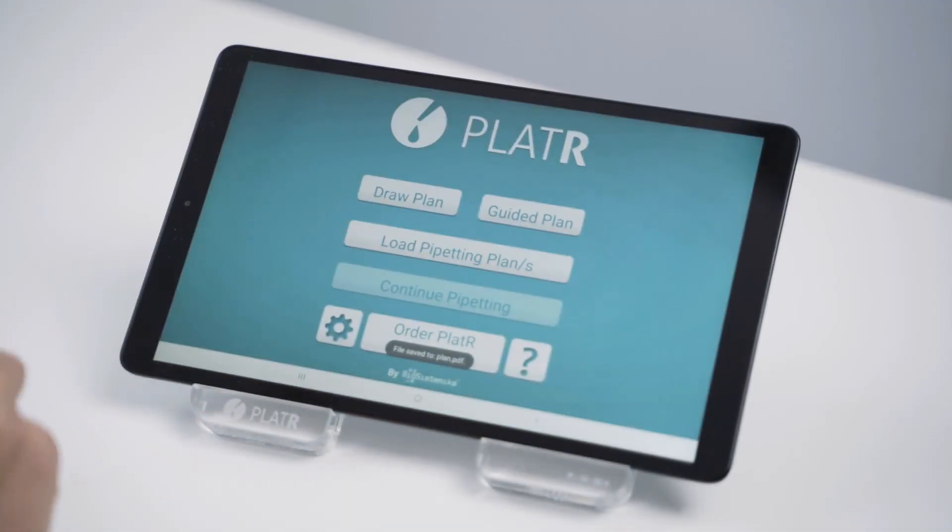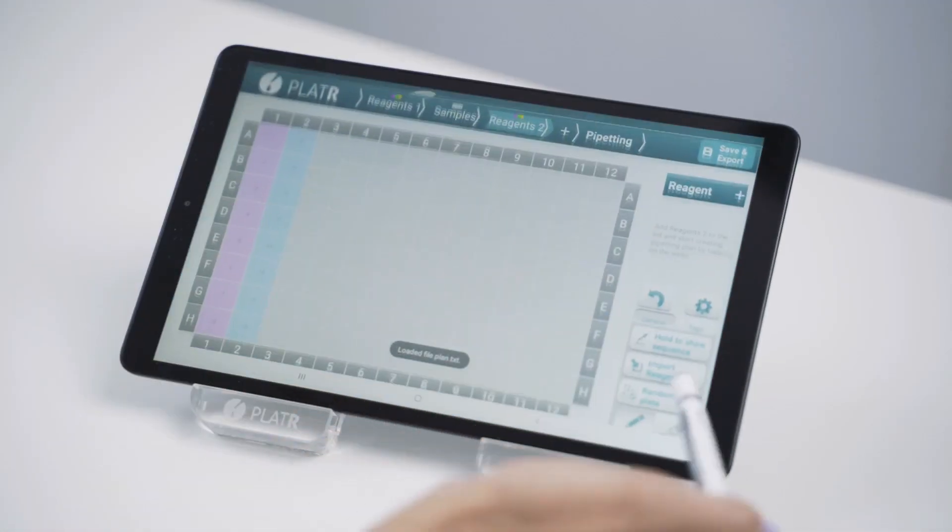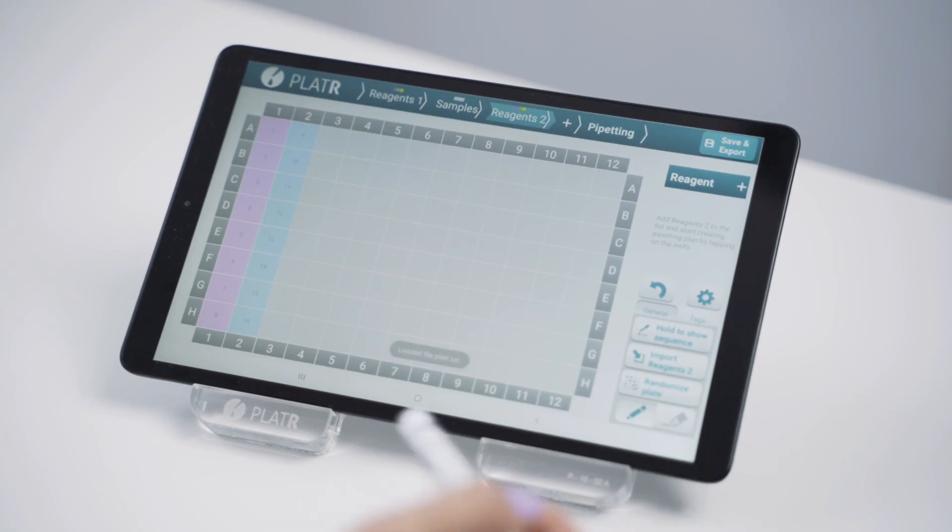Once you have your pipetting protocols saved in Plater, you can use them as many times as you want. Much faster than printing your plan, right?